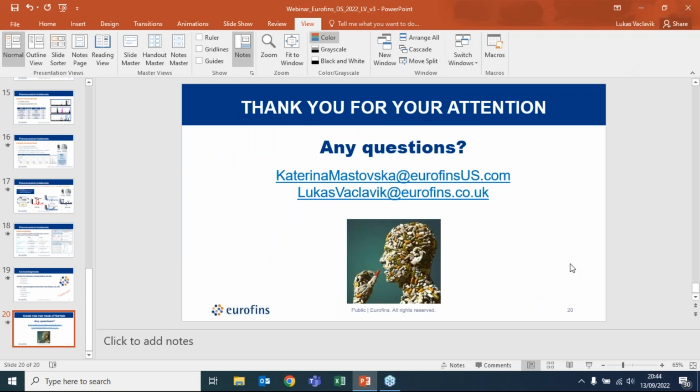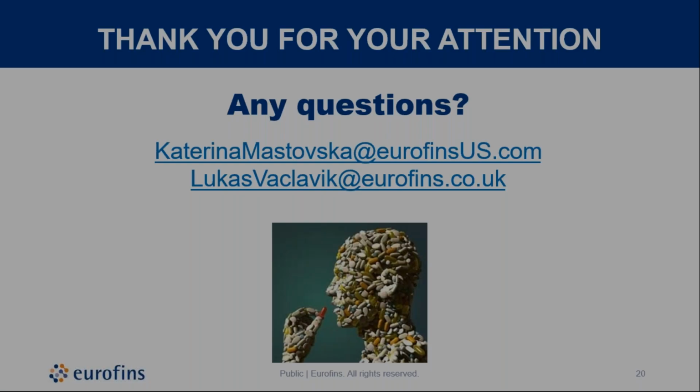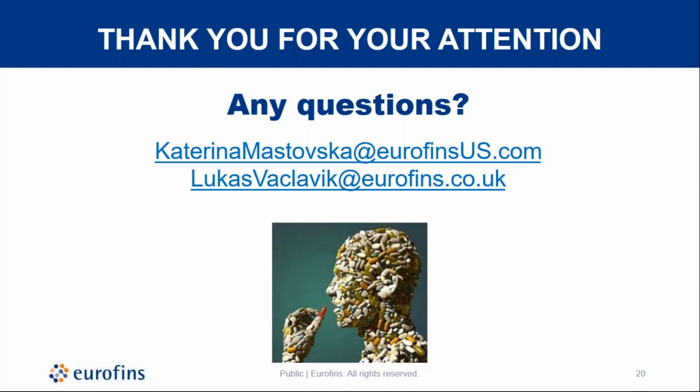The first one, I will kick it off here. Is there an actual method for pesticide residue analysis included in the USP Chapter 561?